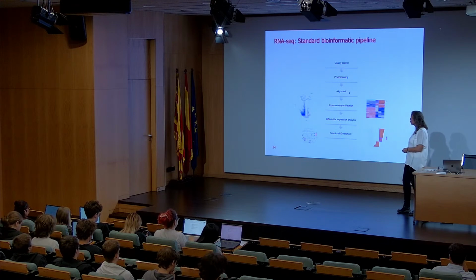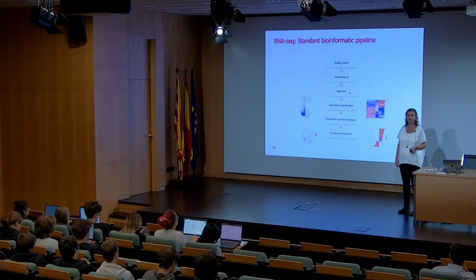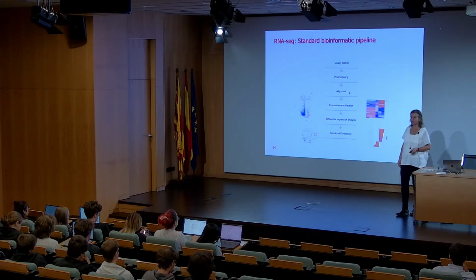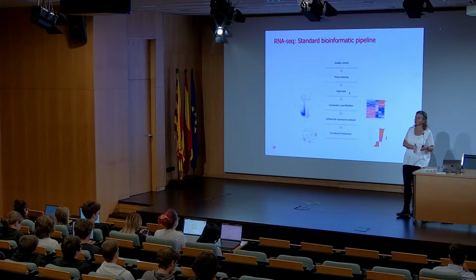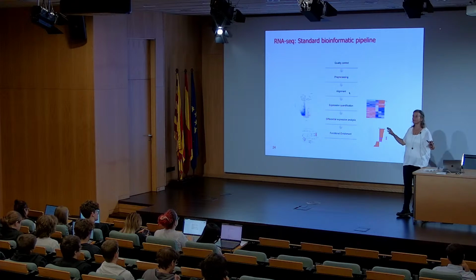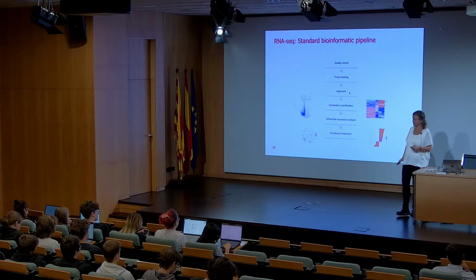And then we perform differential expression and functional enrichment the same way as we did for microarrays. Of course, the statistical methods that we apply in this context are different from those that we use for microarrays, because in microarrays we had continuous intensities, and here we have counts. So statistics is different, but the objective is the same.